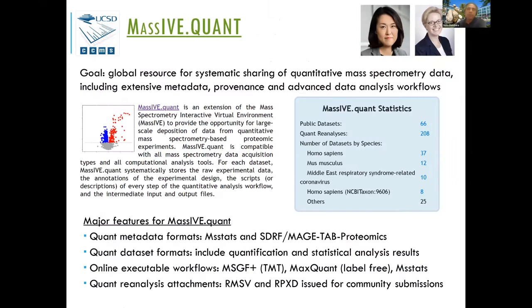So the final point I want to make is a very important aspect of Massive, which is the MassIVE-Quant repository, where the goal is to share and support the quantification data and the statistical analysis of that quant data for the data sets, as opposed to just sharing the raw data and IDs, to also define formats and infrastructure for sharing the quant data, as well as to reanalyze it online.